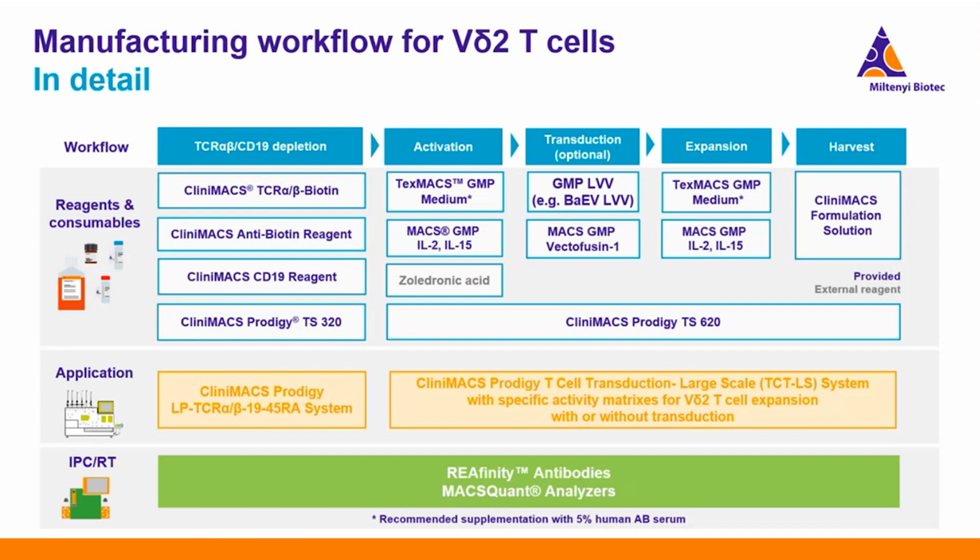We are using a particular process, and some of you might be familiar with this process in general because it was established long ago, particularly to process hematopoietic stem cell transplant, to increase the safety and the anti-tumor efficacy of the stem cell transplant by depleting alpha beta T cells and CD19 cells. But now we have a new process to conduct this step.